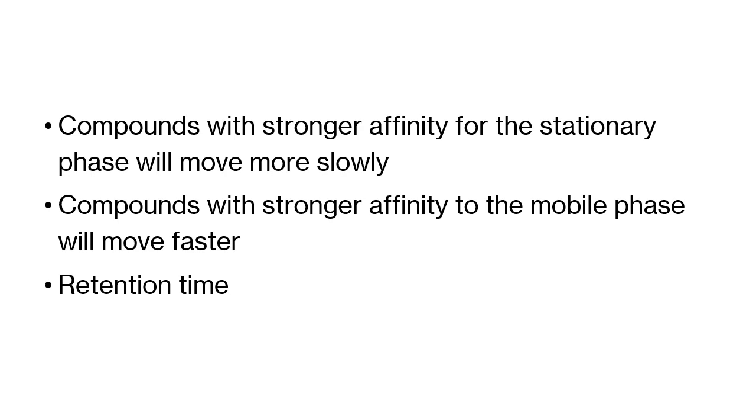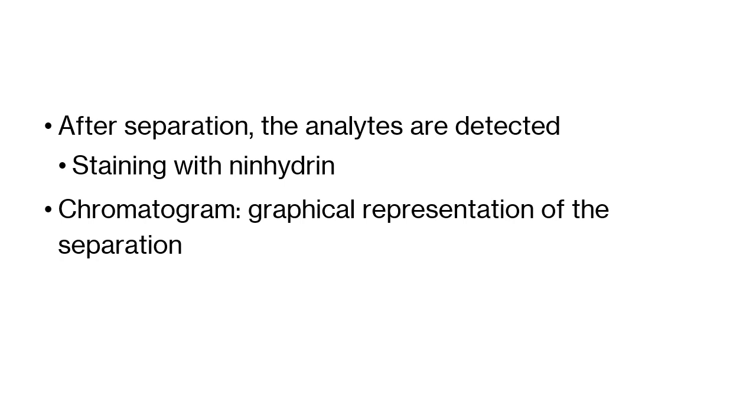This gives you a retention time. For us, the time set was actually 1 hour. Retention time is the time it takes for a compound to travel through the chromatographic system, from the injection, or point of origin, to the detection. Let's take a look later at the retention factor, which is not affected by time because it is uniform at 1 hour.